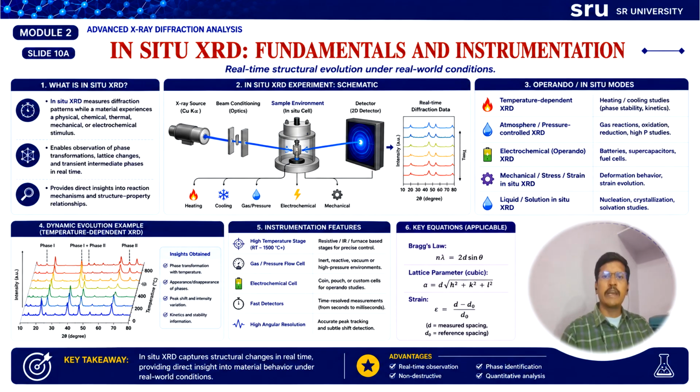Now, look at the operando and in situ modes. Particularly, the temperature dependent XRD studies structural evolution during the heating or cooling process.